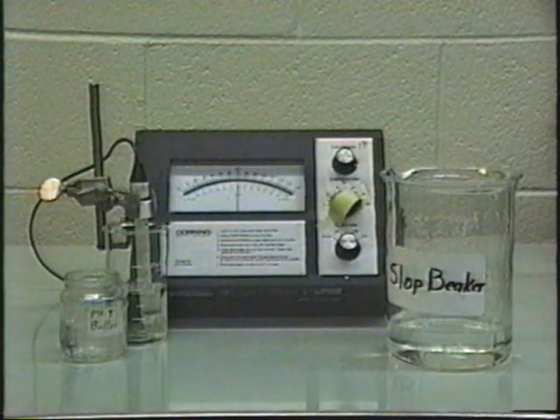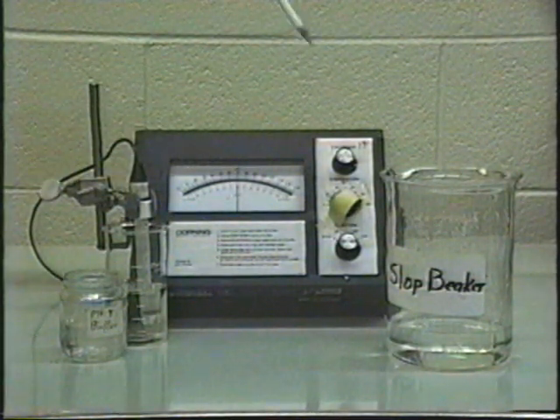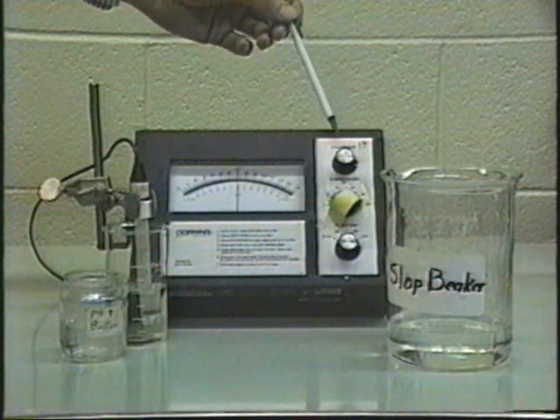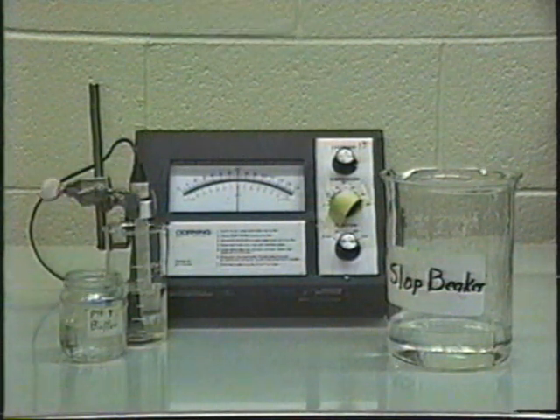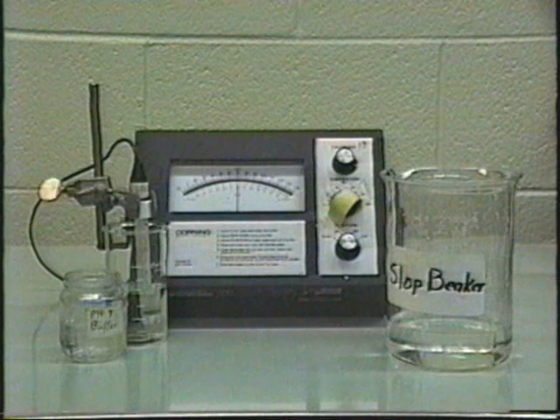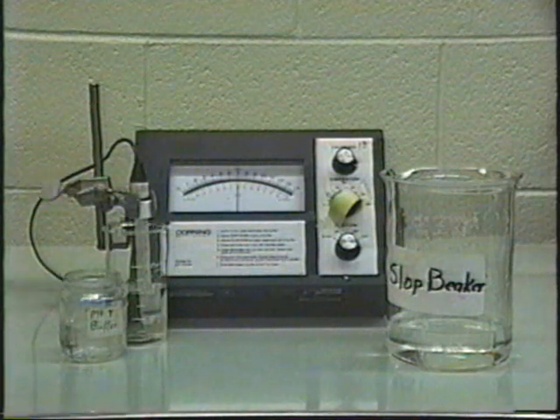Here again then is the pH meter. The pH meter has 3 control knobs. The top one is called calibrate. It's used to calibrate your pH meter to pH 7. Like almost all instruments, the pH meter must be calibrated before use.